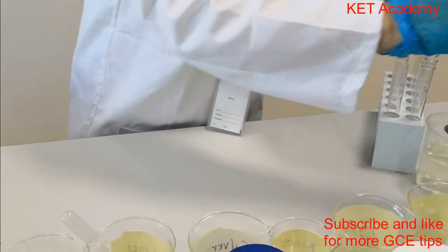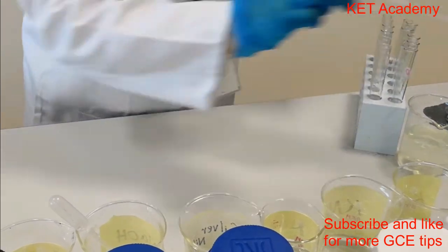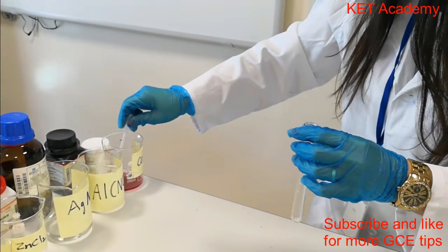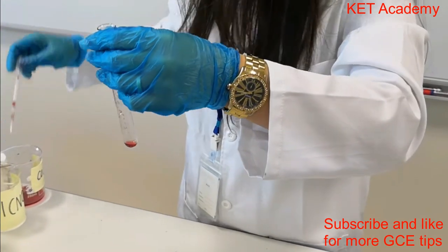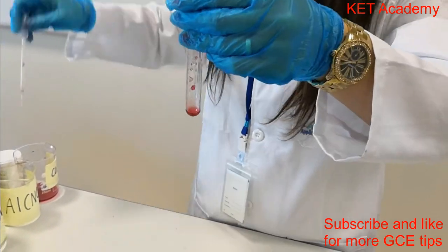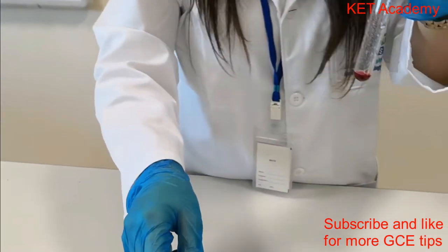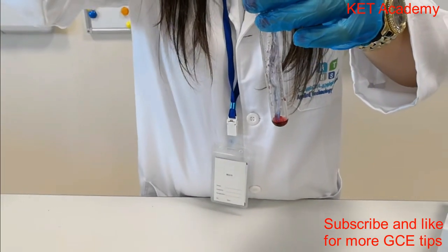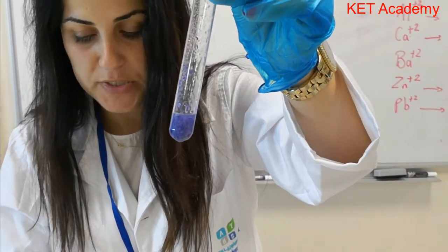And finally, trying a cobalt solution. The cobalt already has a dark red color. If I add to it sodium hydroxide, the color turns to a blue precipitate. I get a dark blue precipitate.